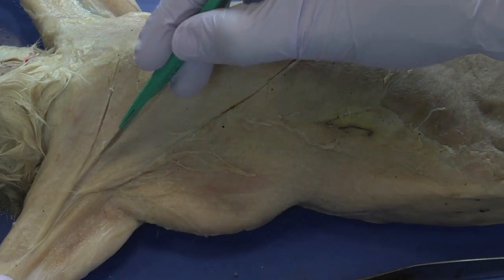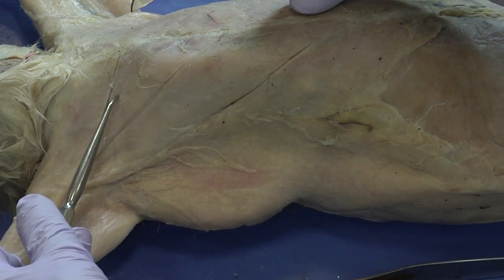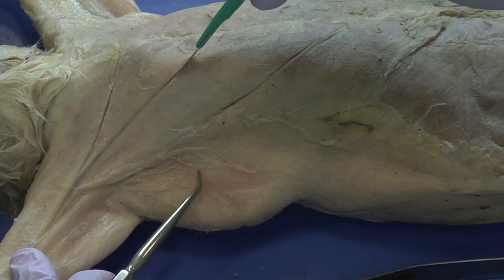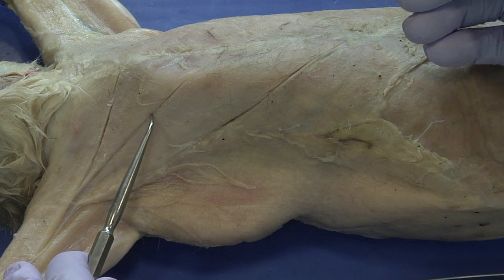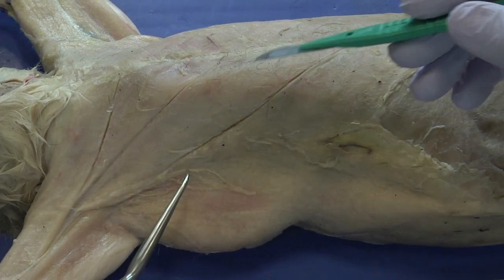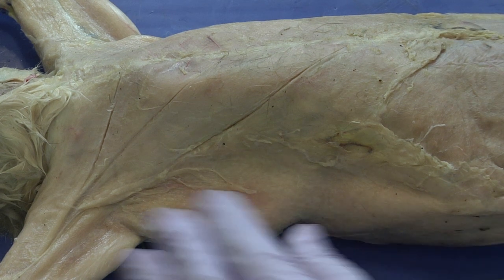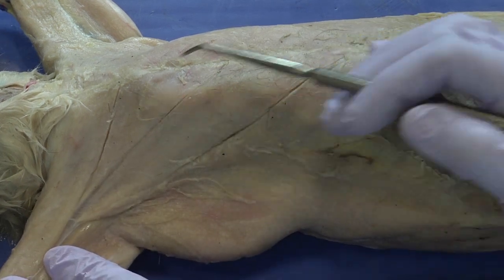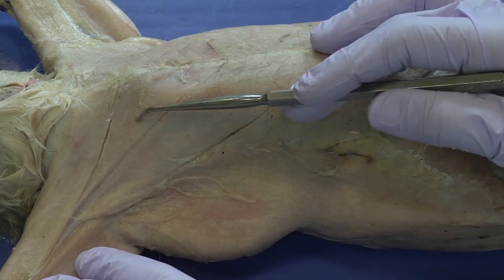We have an upper border and a lower border for the pectoralis major. That same lower border for the pectoralis major is the upper border for the pectoralis minor, and then we have the lower boundary for the pectoralis minor. These are the only two chest muscles we are going to isolate.